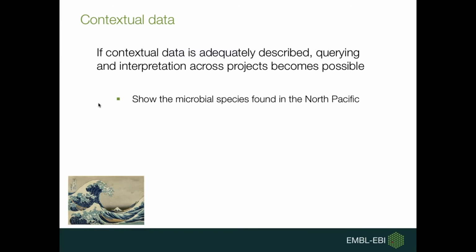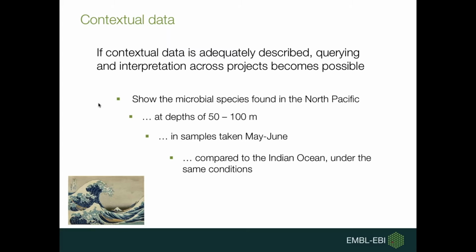You can say things like, show me the microbial species which are found in a particular oceanographic sample at particular depth, at particular time points, and then compare these to samples taken from a different position under the same conditions. So it allows you to really interrogate your data in a meaningful way.